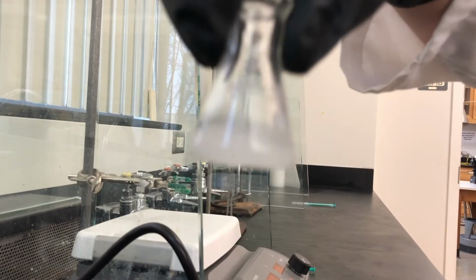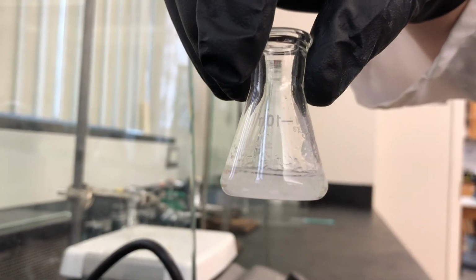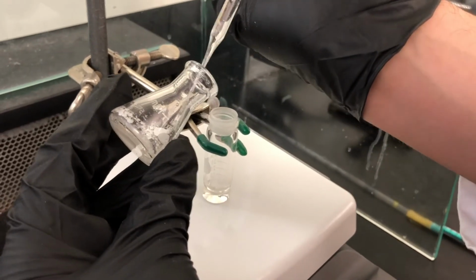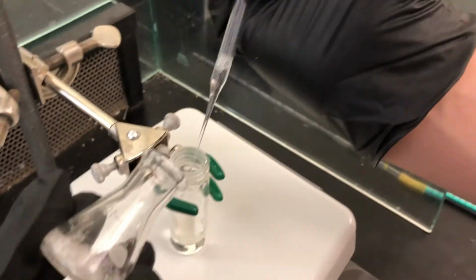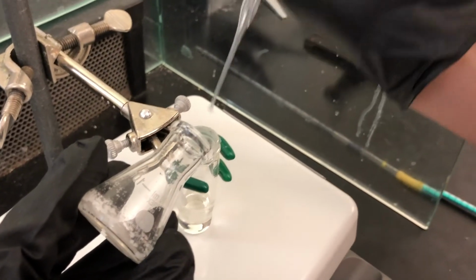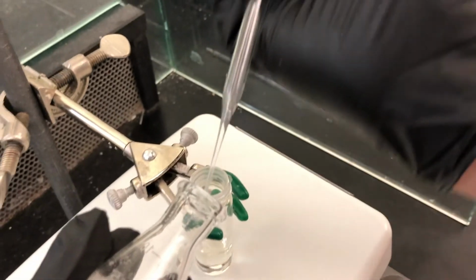It's mostly free flowing, so we're going to assume it's enough to dry the solution. Okay, so we're going to transfer this into a clean conical vial. This should be our pure cyclohexanol in methylene chloride.